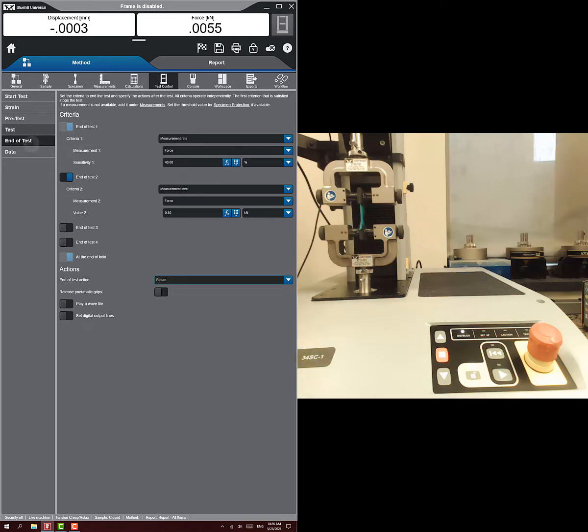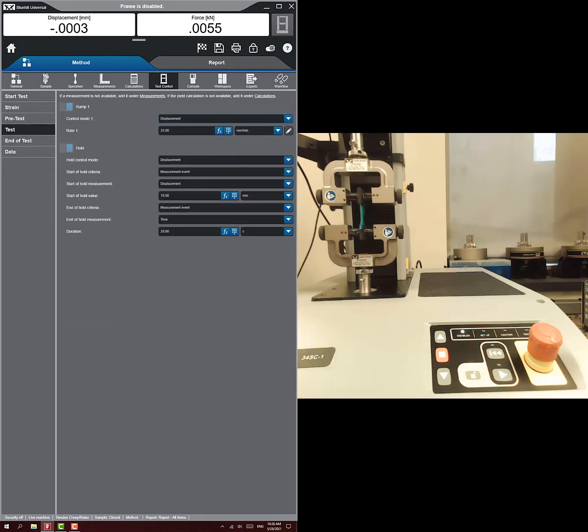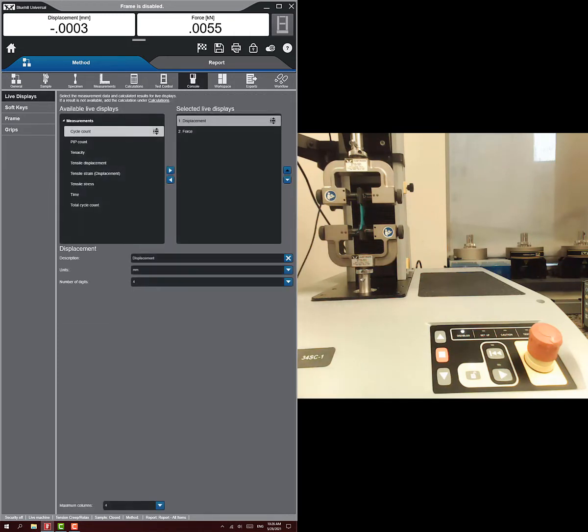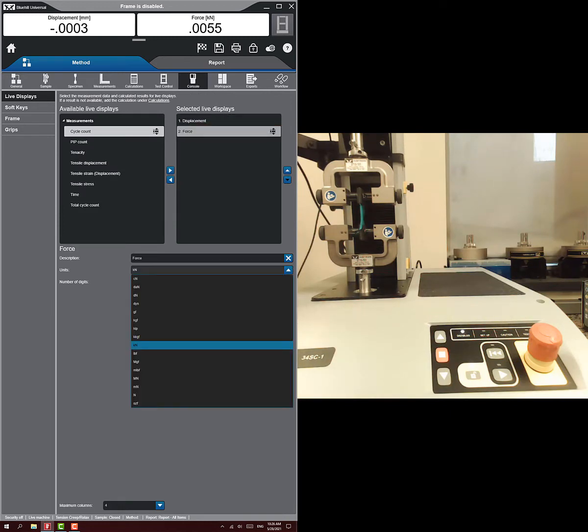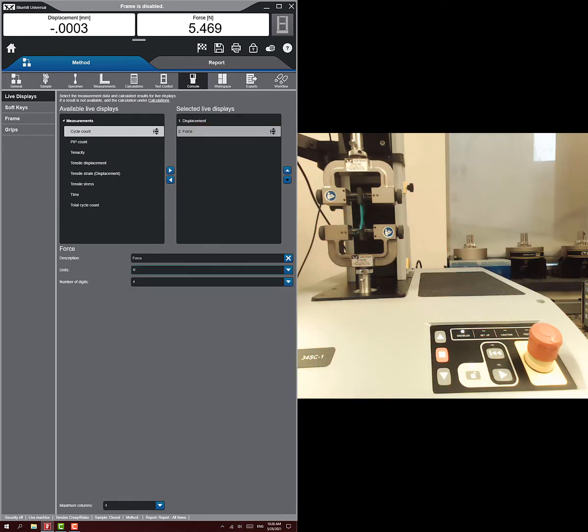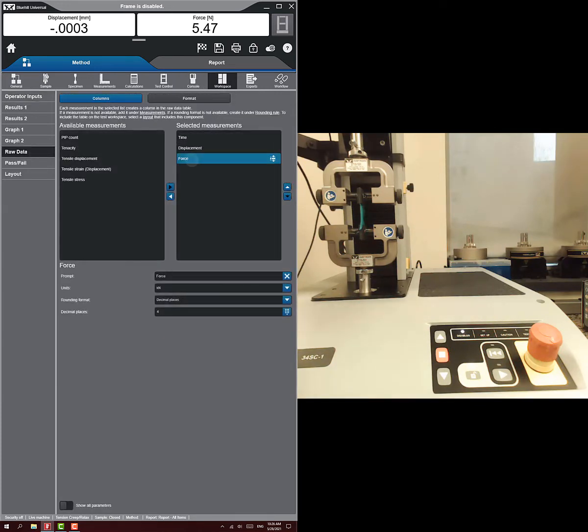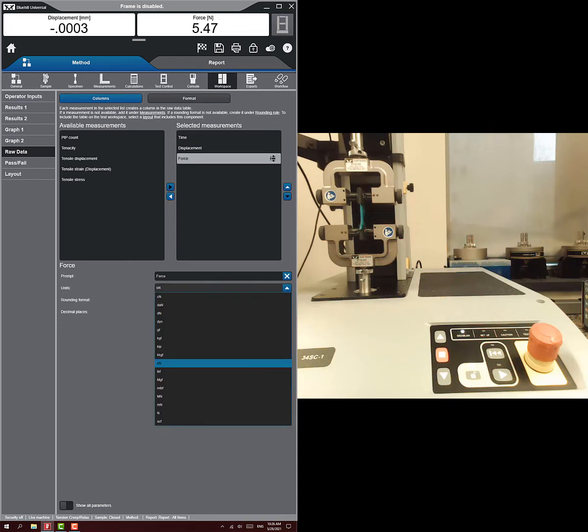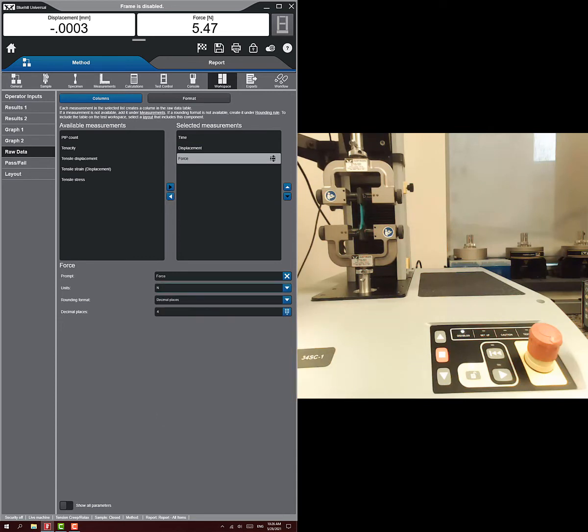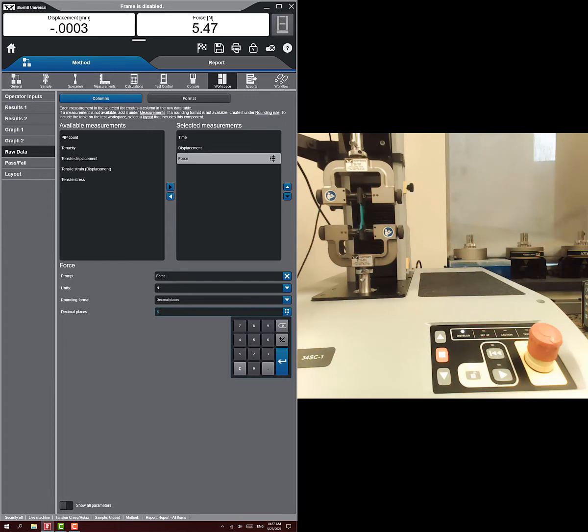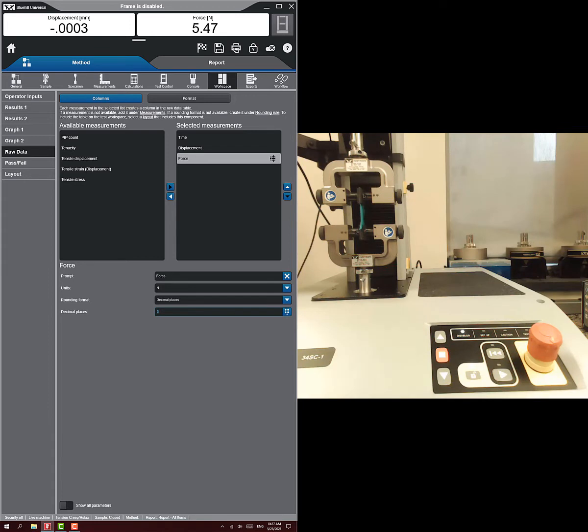So we set up test and end of test. Then we just do the other things like we did before. We're going to set up our force on our console. We're going to do it in units of newtons. And definitely our raw data, we're going to make sure we set our force units of newtons rather than kilonewtons. I'll choose three decimal places.